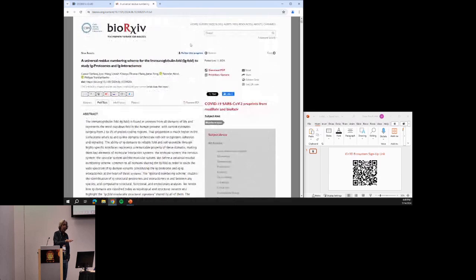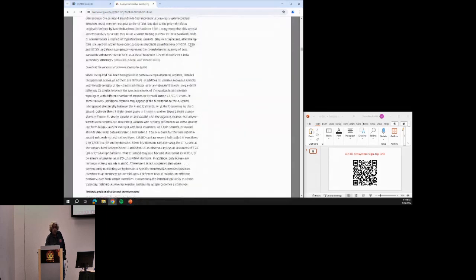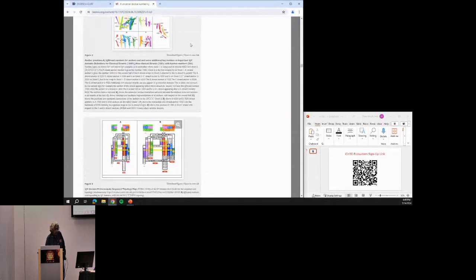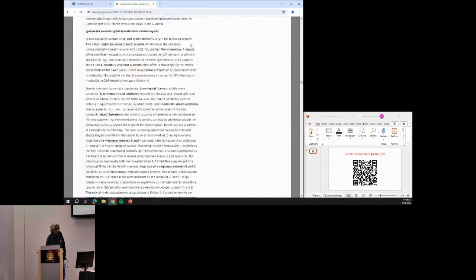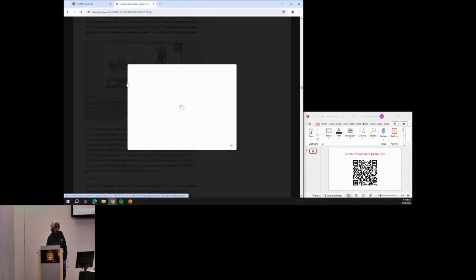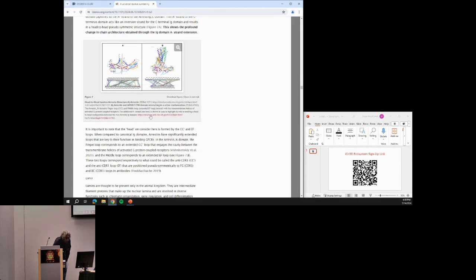So, I mean, you go to that paper that's very new, and you will have a lot of examples there of all sorts of proteins and all sorts of analysis that we've done. So Barry's not here, but he's working a lot on IG domains, and let's say, for example, that you have, I'll take something simple here. So here is, for example, arrestin. The link is in the caption. So the arrestin, and here you would have, for example, open link in new tab. Did it work? Yeah, okay. You have to just click on the tab next to it.